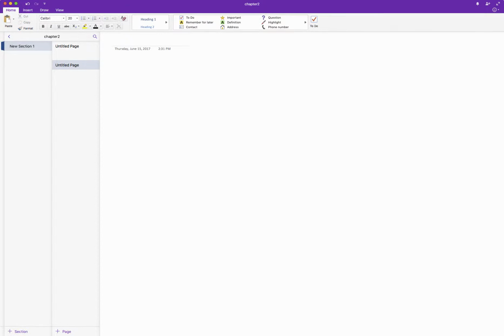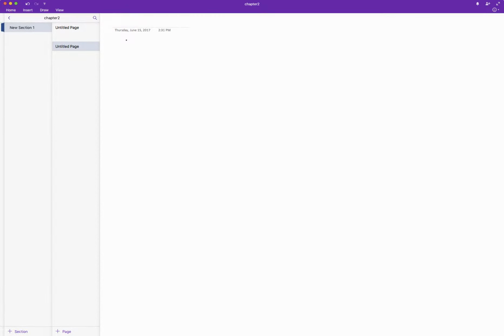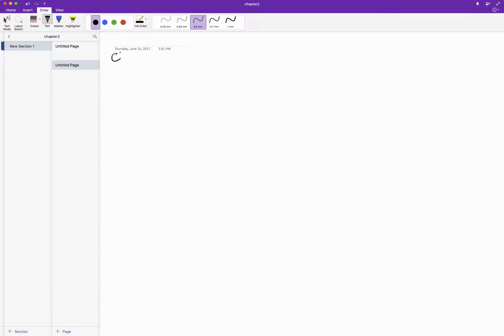So this is chapter 2, part 3, where the book talks about line shape. So to begin with, NMR, when we measure the signal, we get basically intensity versus time.